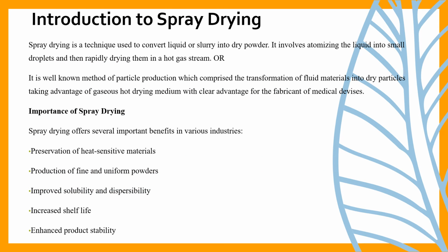The next topic is introduction to spray drying. Spray drying is a technique used to convert liquid or slurry into dry powder, which involves atomizing the liquid into small droplets and then rapidly drying them in a hot gas stream.